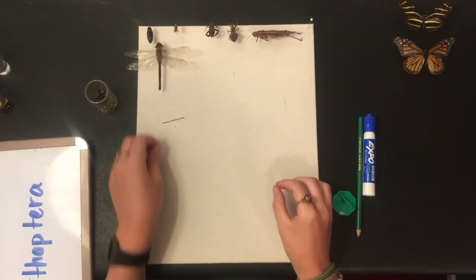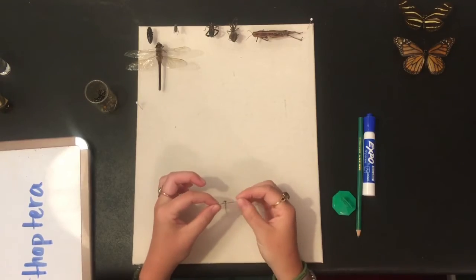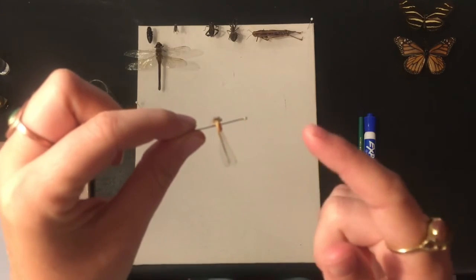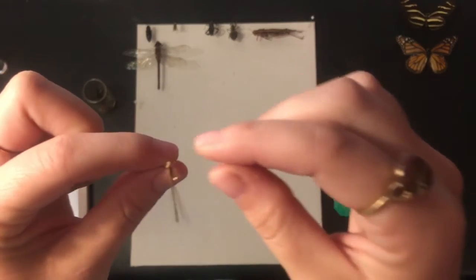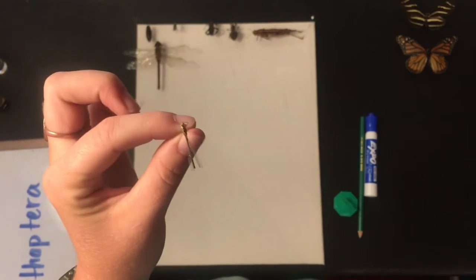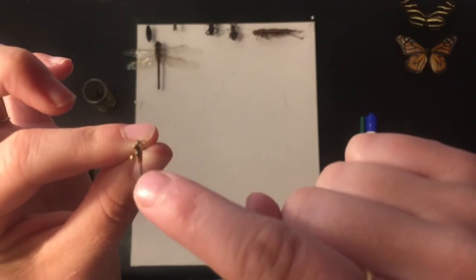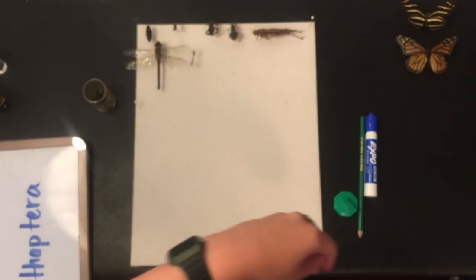Then we have our little damselfly — they're going to be pinned about the same, they're just a little bit harder to see. So the smaller the insect gets, the harder it is to pin them simply because they are smaller and we have really large hands. It takes a lot of patience. Finding that midline and then pushing it right there to the right — that's our damselfly.